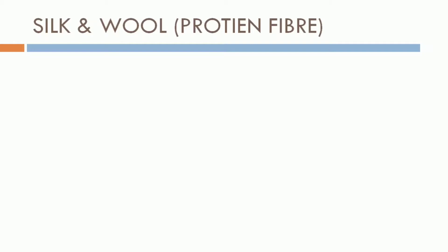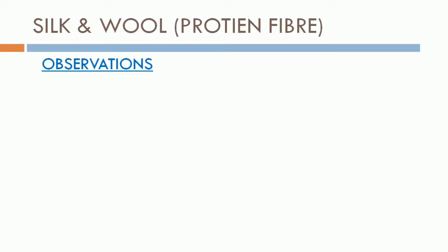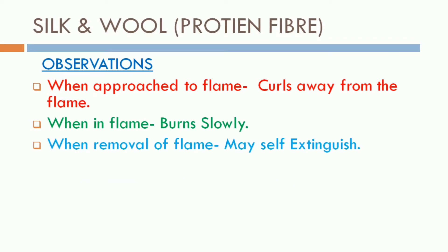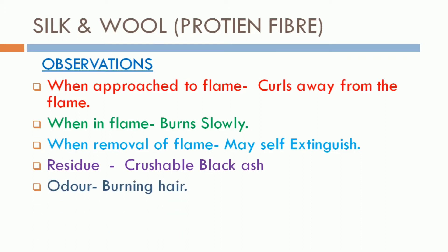Next, protein fibers — that is silk and wool fibers. Observations: when approached to the flame, the fiber curls away from the flame. When in the flame, it burns slowly. When removed from the flame, it may self-extinguish. The residue is a crushable black ash and the odor is just like burning hair.